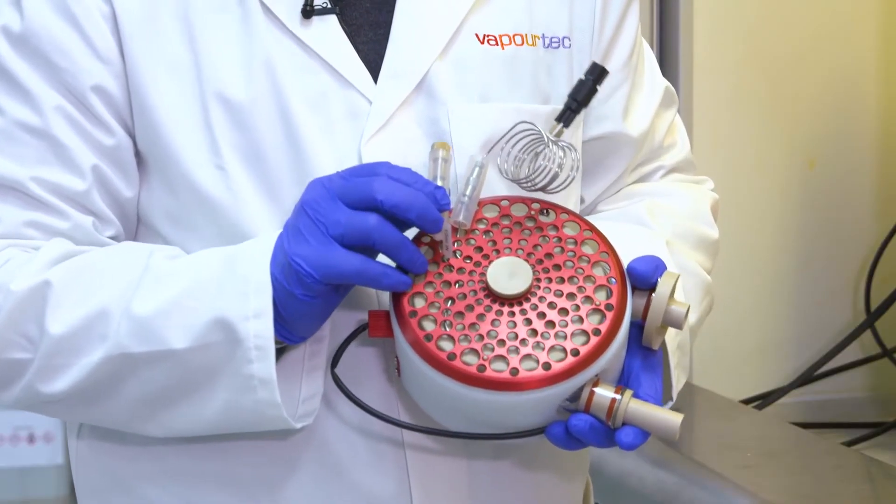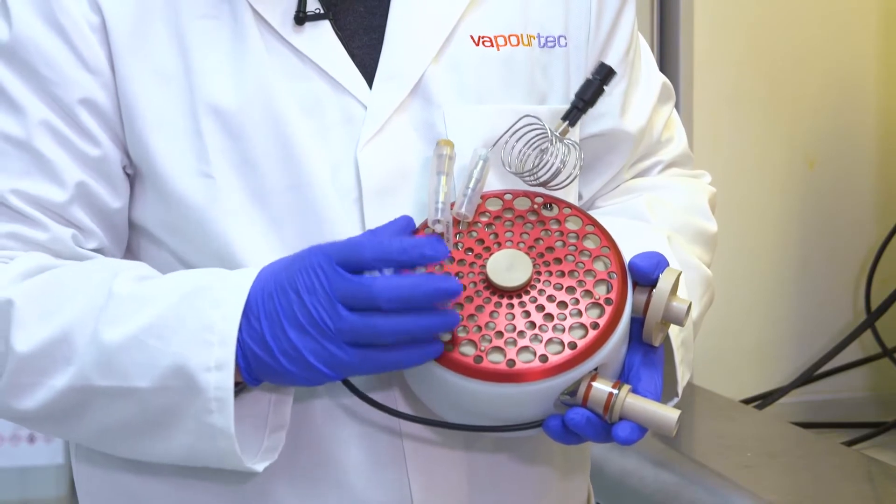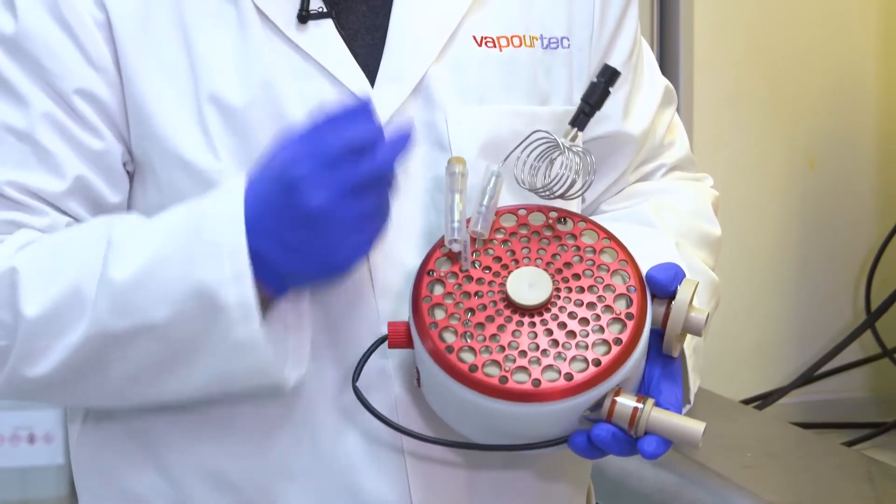On the inlet line you have a check valve and this is very important because it prevents any solvent boiling and traveling backwards out of the reactor.